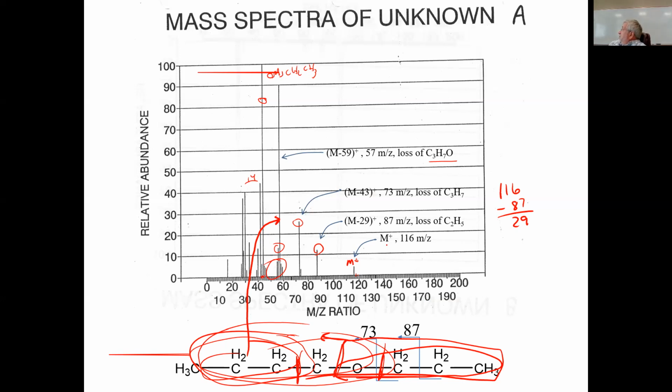That's what I do. If I have the molecular ion peak, I just say, well, what about this peak? What could it possibly be? I look at the different losses, and it will tell me maybe it's a methyl, maybe it's ethyl, propyl or something, or chlorine. And if I can't figure out anything, well, I don't know. You go to the next peak, and maybe that'll help you.